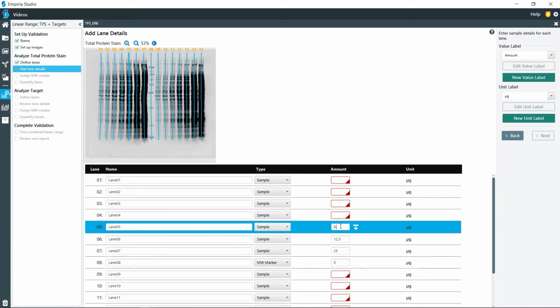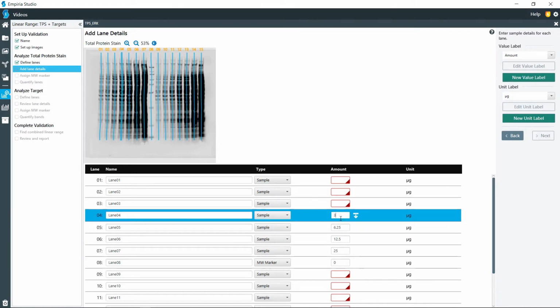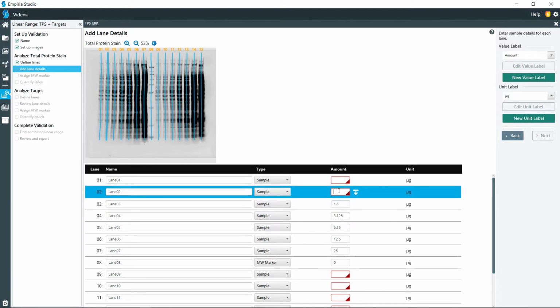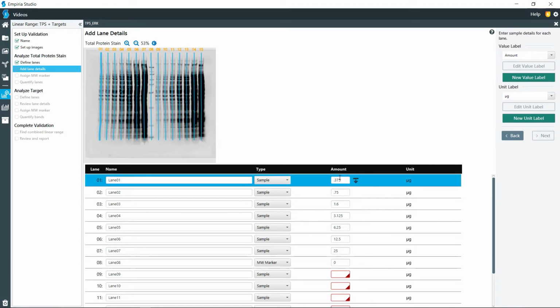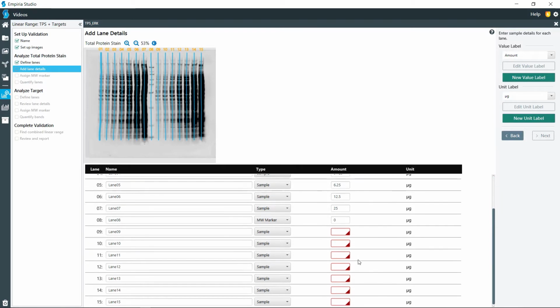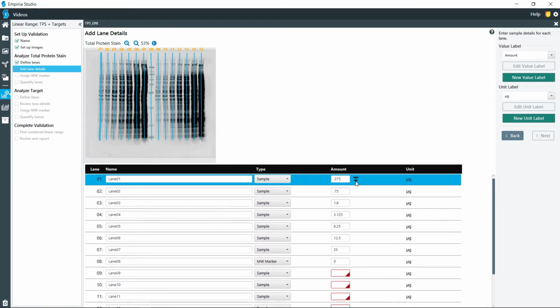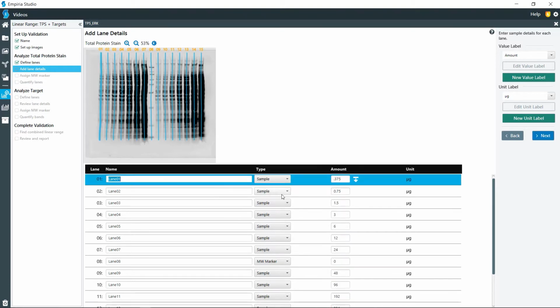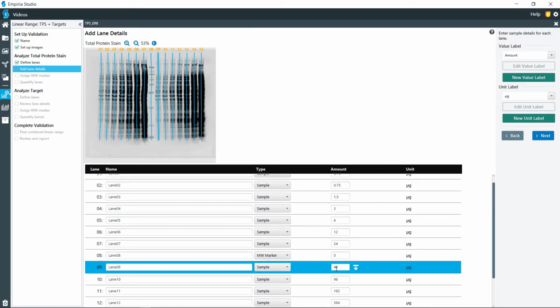12.5, and so we have all of that information here, and then we can also repeat that. Now, another way that we can do this is if I click on here, I can say a 2-fold. If I say 0.5, then it does that all the way up through there. And this is just a repeat of this.